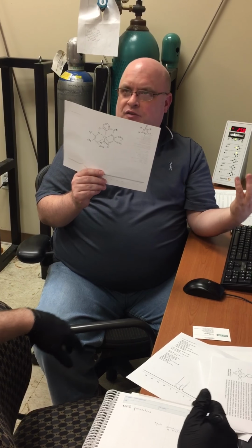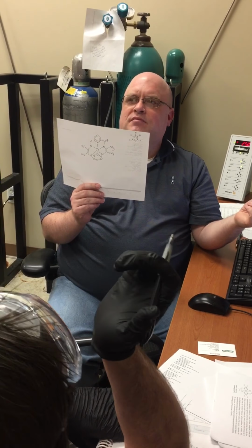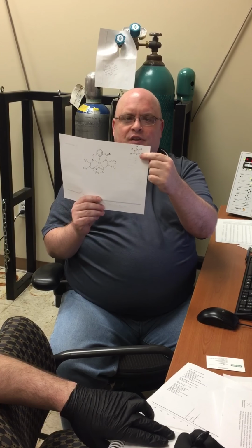If I'm looking at this signal, how would I know what it should look like? Is it going to look like a singlet, a doublet, a triplet? In this case, it's not going to be complex. So what is our general rule? N plus 1. How many hydrogens is it next to? Just this one. So this one should look like a doublet.